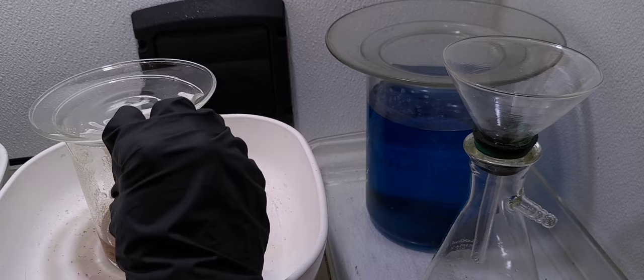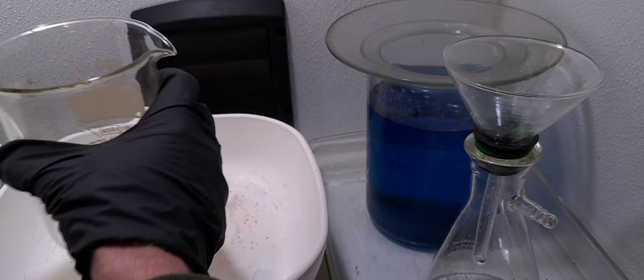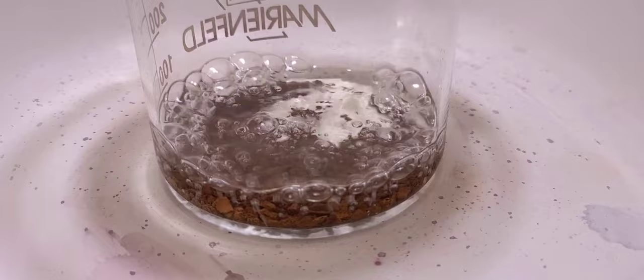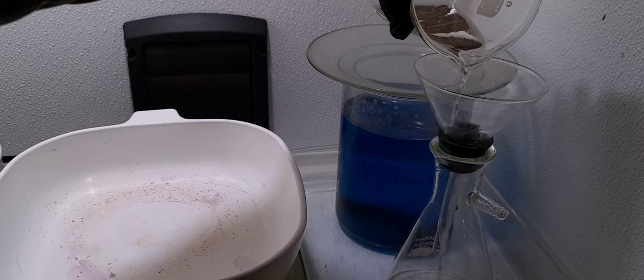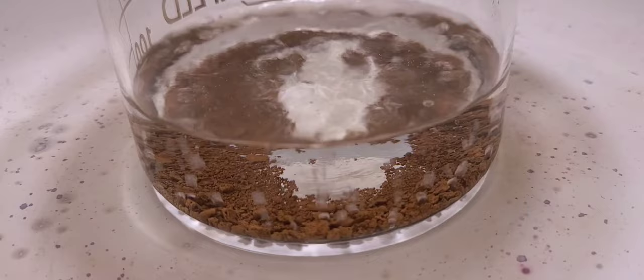Here we go with our final rinse procedure. It seems like a lot going through all these rinses, but it's really necessary. Distilled water — get that old stuff off of there. Let it cool back down, then decant it off. And here we're going to go with some hydrochloric acid, some HCl — give that another quick boil to get in all those pores, then decant. Back to a few rinses with distilled water.